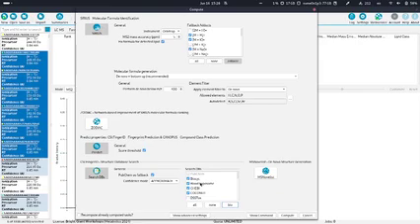And what is new now in SIRIUS 6 is that often it was the case when you ran SIRIUS that you search for hits in the bio structure databases and you couldn't find your structure. And then often people reran the computation and then searched in PubChem. So in many cases, you don't want to use PubChem already in the beginning. But what you have now in SIRIUS 6 is that if we have not found any good hits in our structured databases which we have selected, we can use PubChem as a fallback.